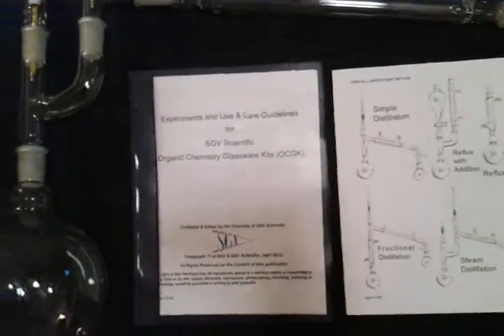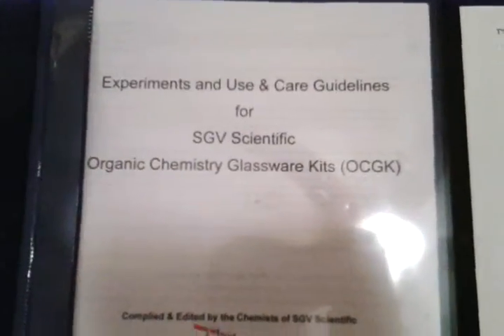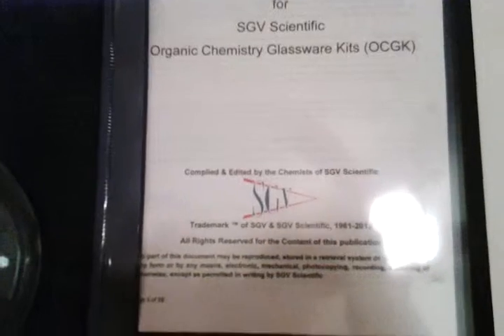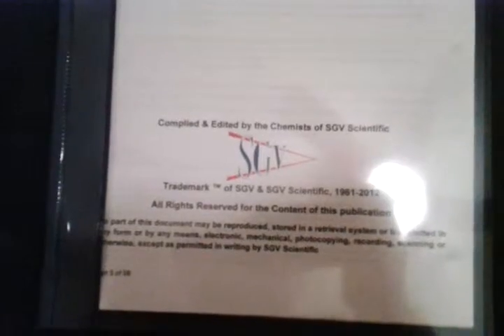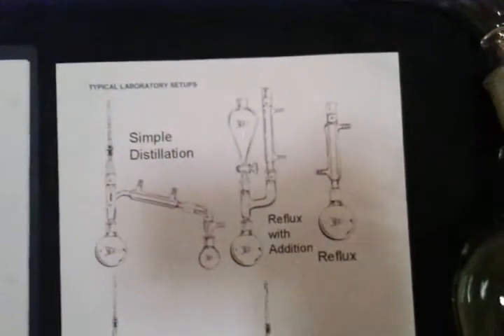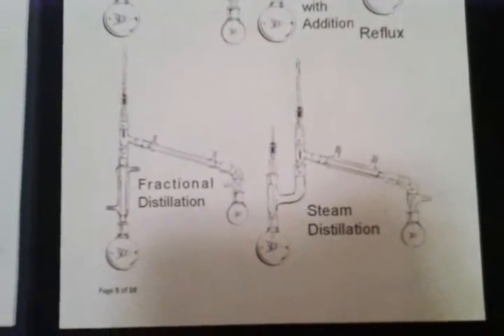This kit also contains a booklet of experiments and use and care guidelines for the Organic Chemistry Kit. This includes experimental procedures, practical safe handling instructions, and techniques and details for the proper installation, assembly and use of your glassware kit, with detailed drawings and assembly instructions for different types of techniques that can be performed.